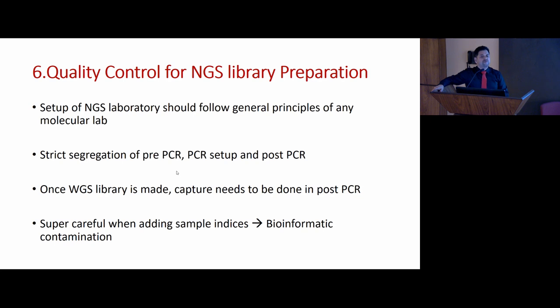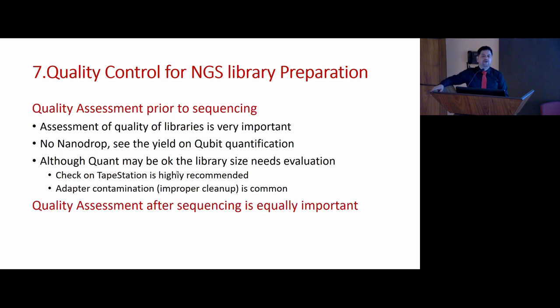Even though there may not be a sample there, even if the index goes from here to there, you are adding contamination. So this is a unique thing to genomics you must be aware of, especially if you do MRD testing. If your cutoff is 5%, it doesn't matter. But if you are doing MRD testing, it has serious implications.